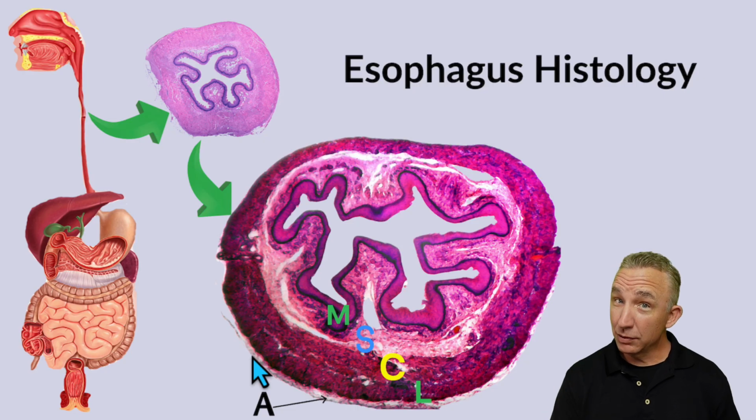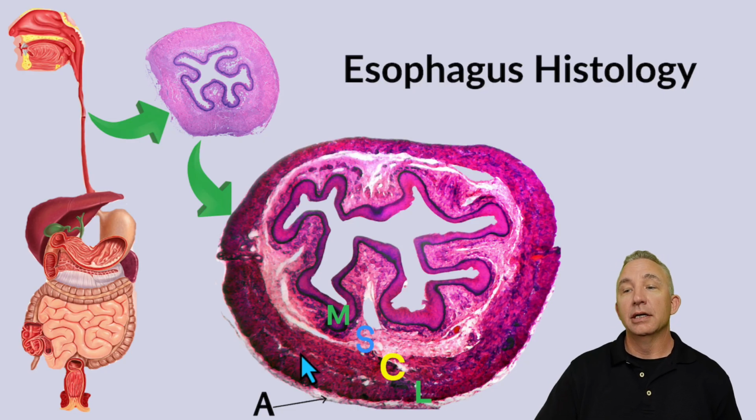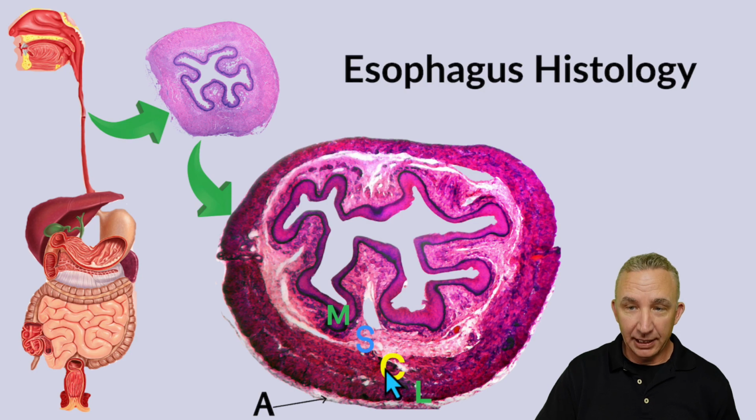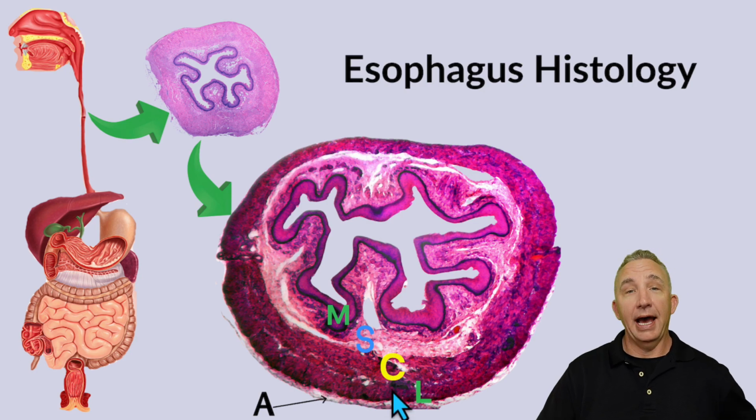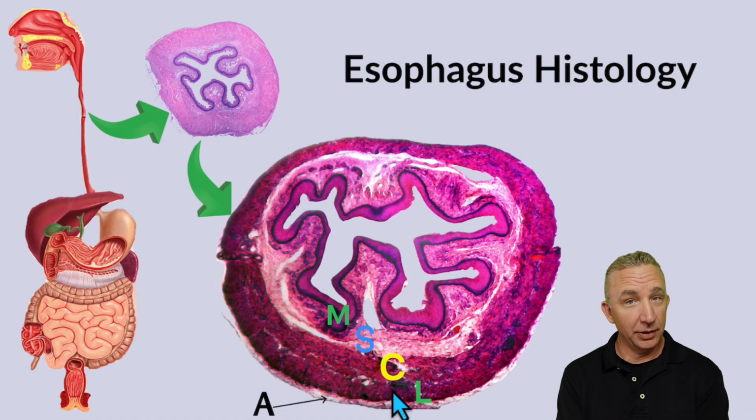Remember, when we look at mucosa, 3 types of tissue: epithelial, connective, and then my smooth muscle. So epithelial, loose connective, and my smooth muscle. And then when I get into my muscularis externa, I have circular and longitudinal. How do I identify this as unique to other organs? I did another video on small intestine. They look like fingers to me, which are the villi.